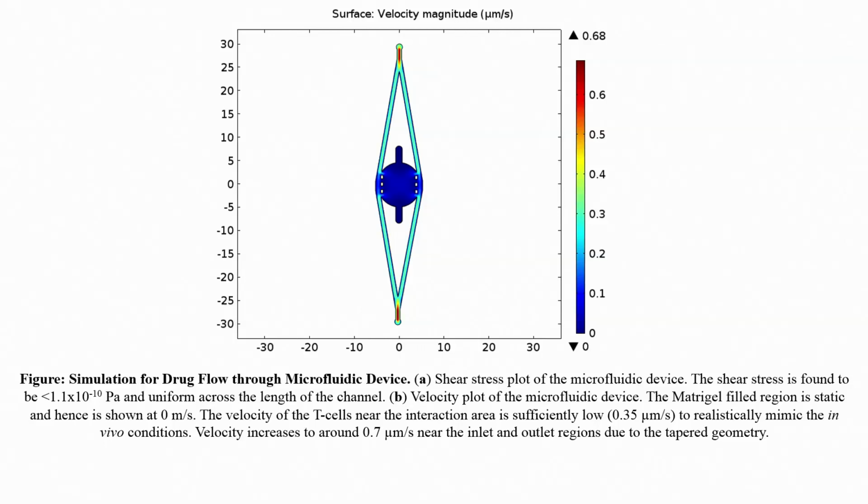Now, like I said, we always need to perform a simulation before we actually fabricate a device. Okay. So, before you go for any fabrication, we always have to go for simulation. In a microfluidic chip, you need to perform analysis such as velocity, stress in the device, whether the flow is smooth or not, right.